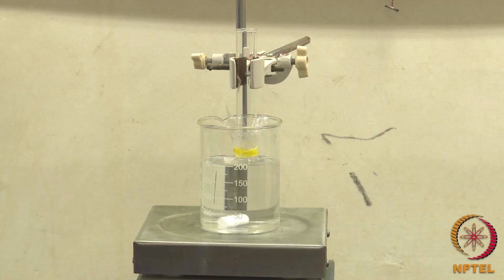The beaker was then placed on a magnetic stirrer at 50 rpm, and the temperature is maintained at 37 degrees Celsius.